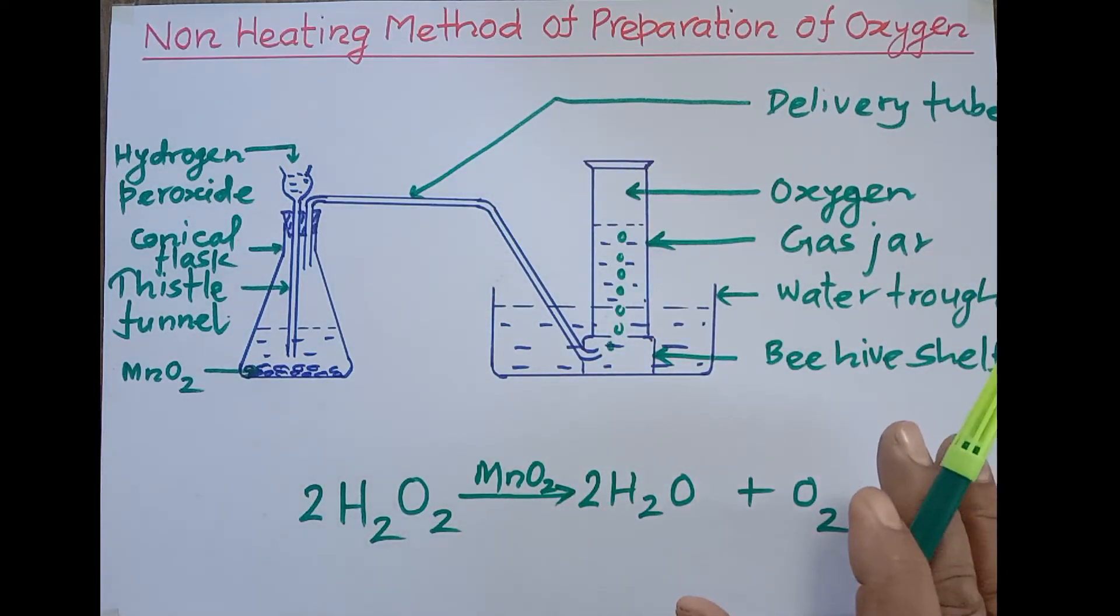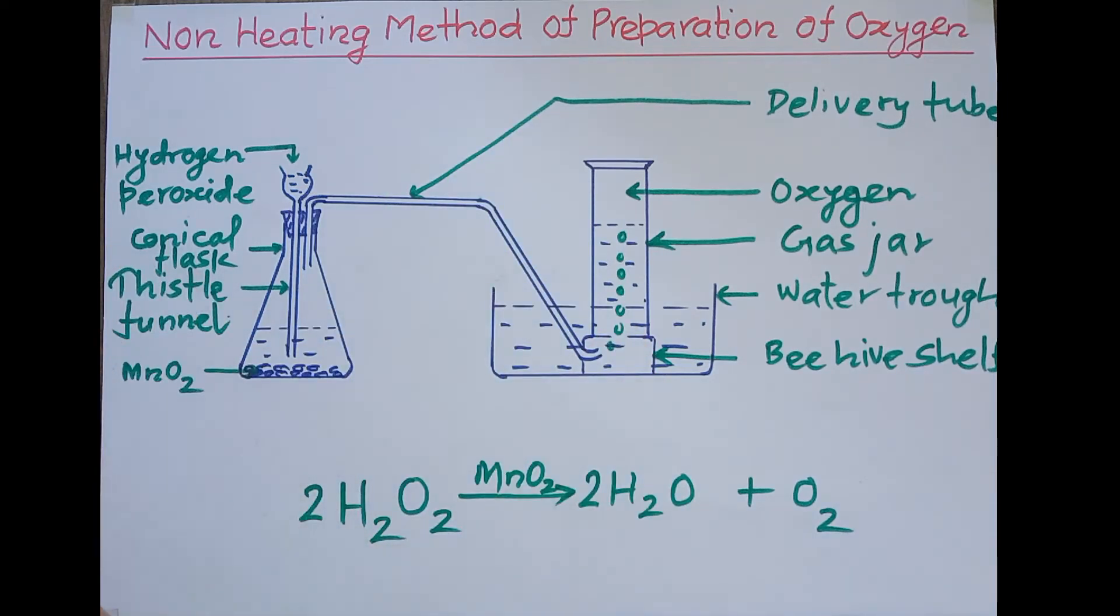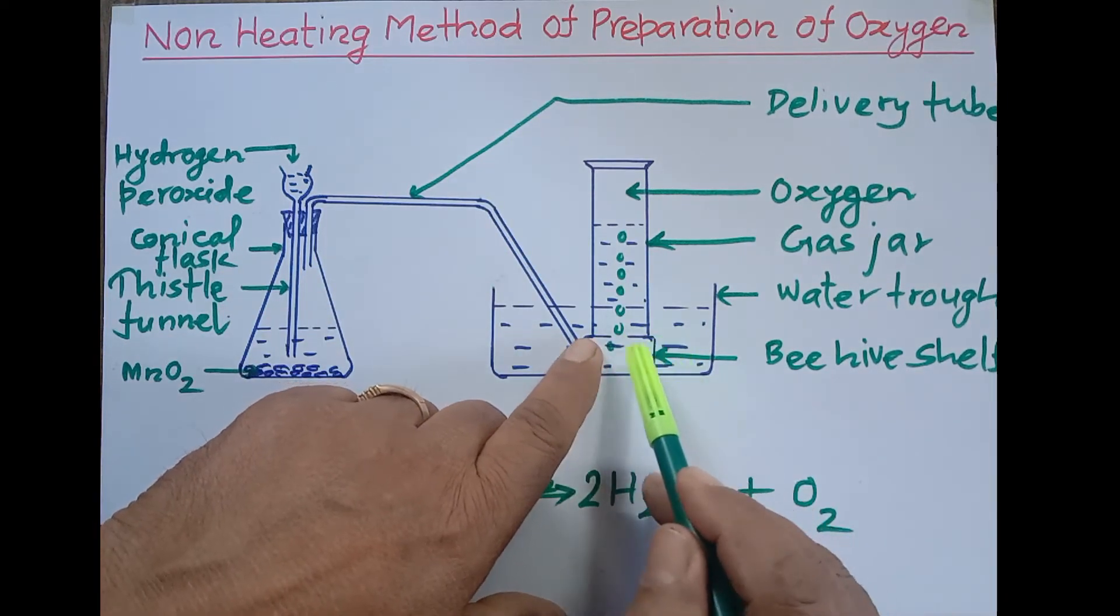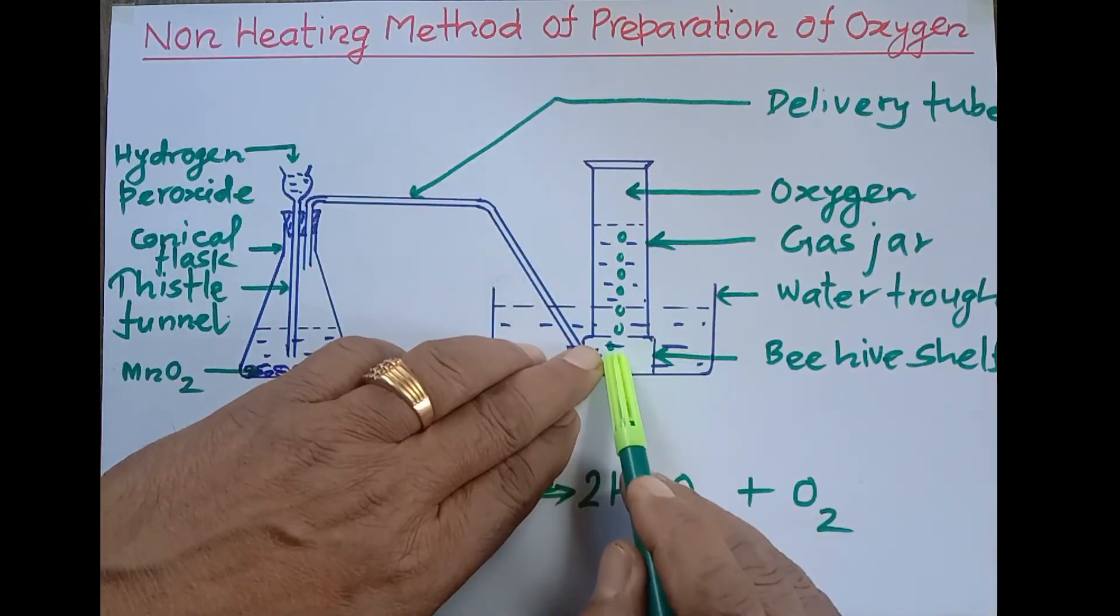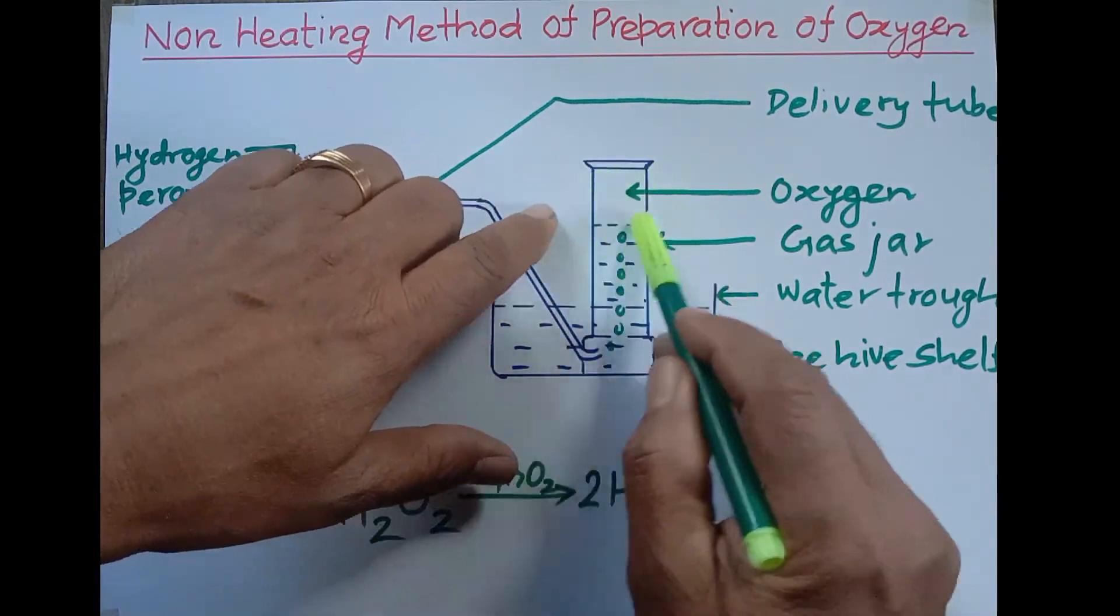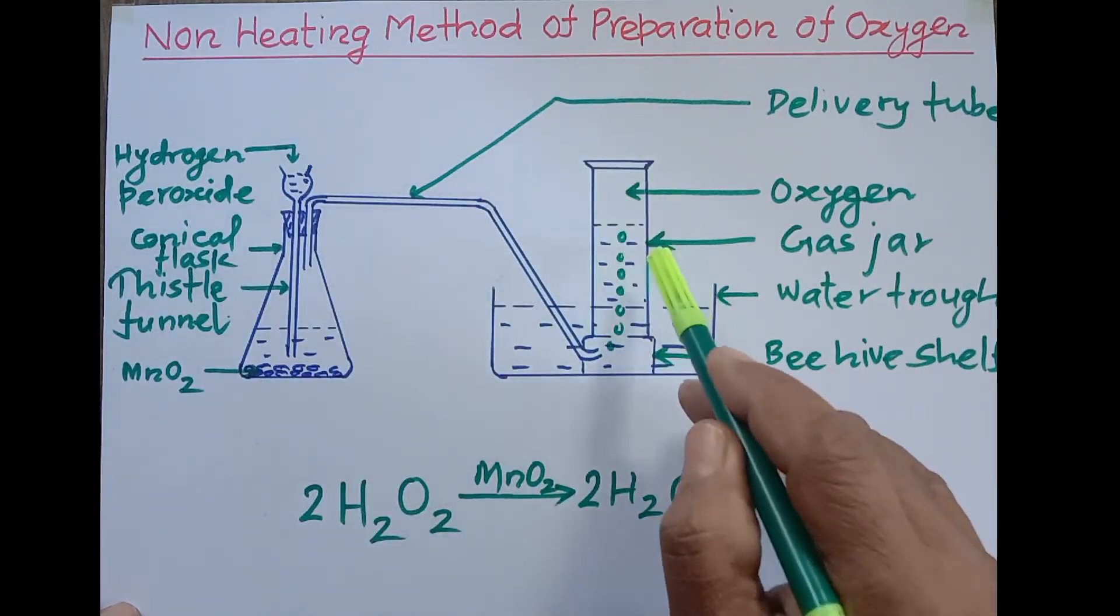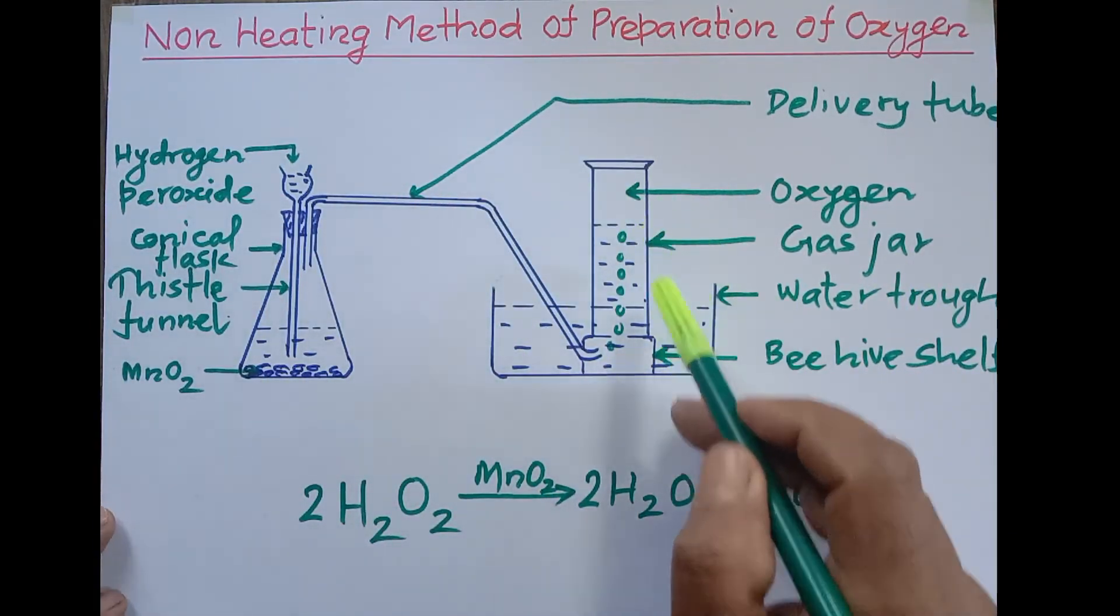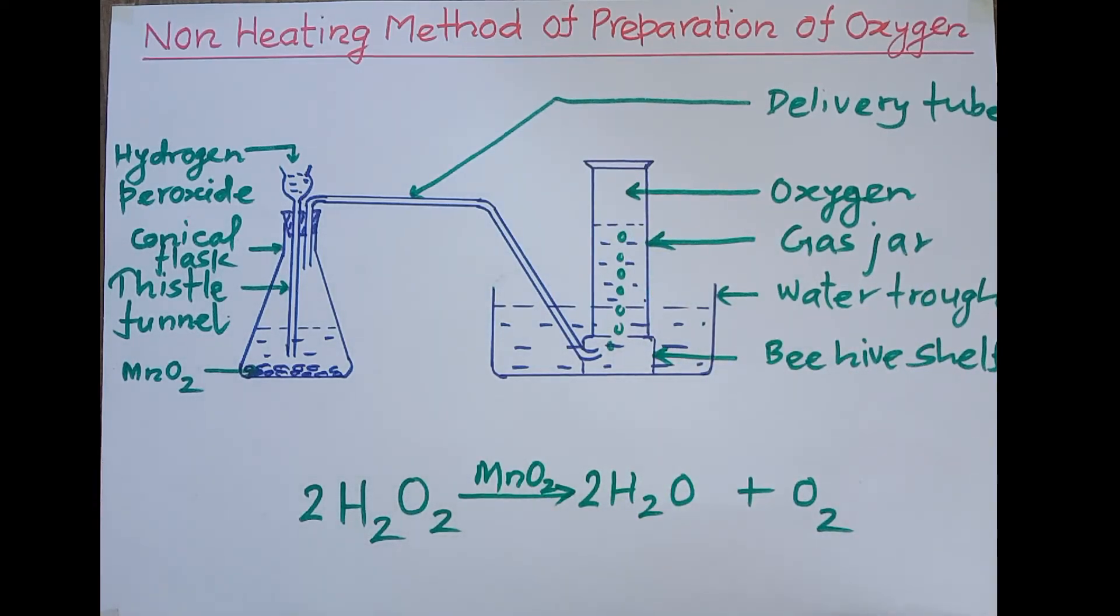The gas jar's mouth should be covered, and then we have to invert it into this beehive shelf, inserting our hand into the water. There must not be air inside this gas jar. Air should not enter into the gas jar, otherwise our gas will be a mixture of air and oxygen gas. We have to take care of all these matters.